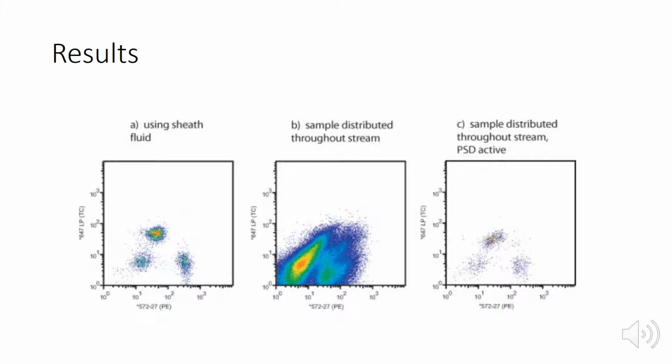The PSD gate discriminates between cells within the stream and the 1.4% of those same cells that are actually correctly positioned for measurement. The rightmost graph is able to distinguish the labeled cells because it only considers cells positioned properly for analysis. The authors discuss that this graph clearly shows their approach is able to recreate both general characteristics of the graph from the traditional flow cytometry approach as well as quantitative results.